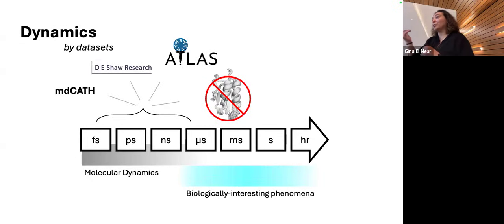And BioEmu is based on AlphaFold, so it's using the pre-trained weights from AlphaFold initially. So it's very interesting that if we had longer MDs for more proteins, perhaps that's the avenue we could take. I was thinking recently about Prost embeddings and whether those would be more interesting. There are a lot of different innovations coming out with different ML architectures, and it would be very interesting to see what insights we get from this kind of analysis or data, and then how that gets trained.